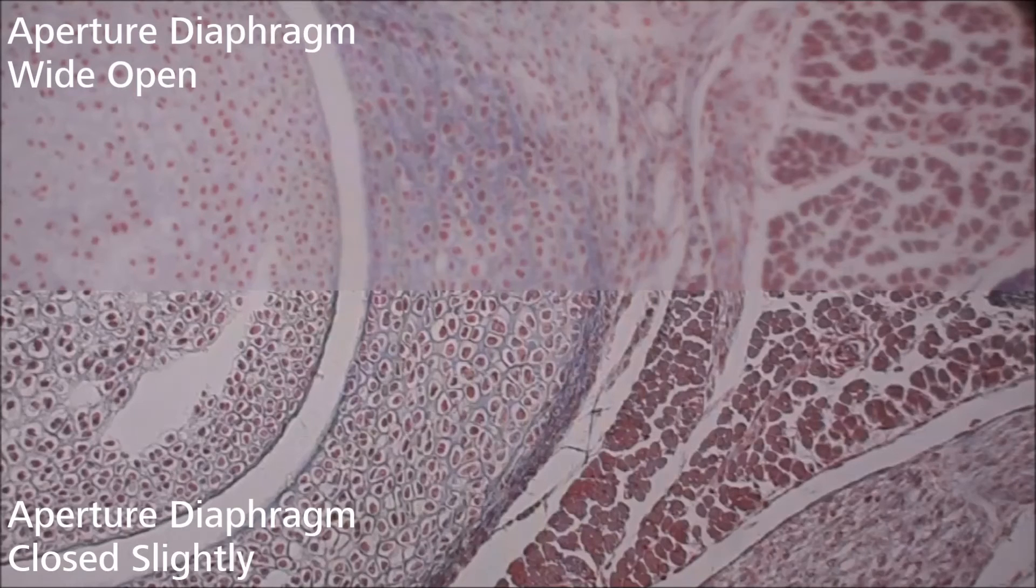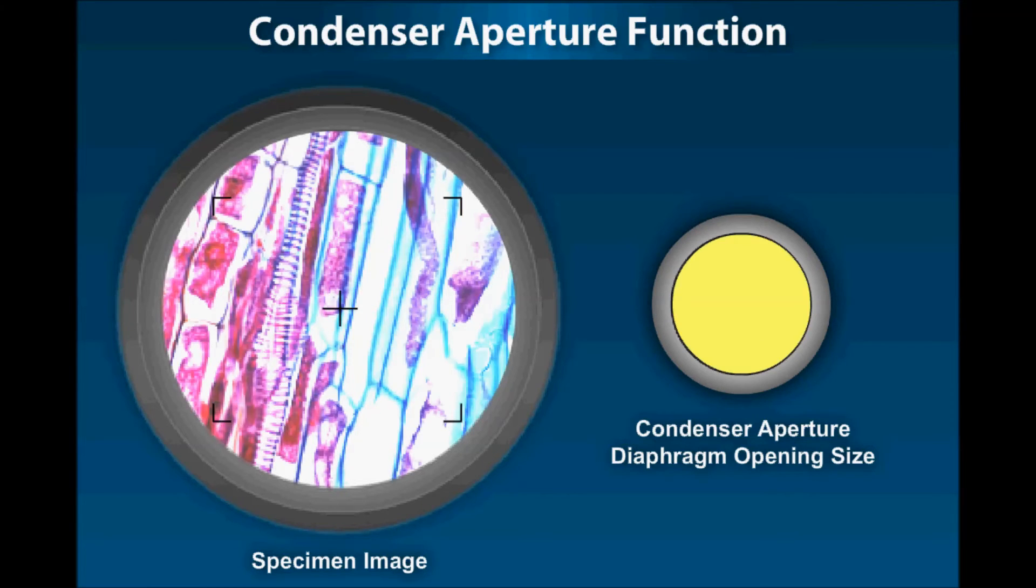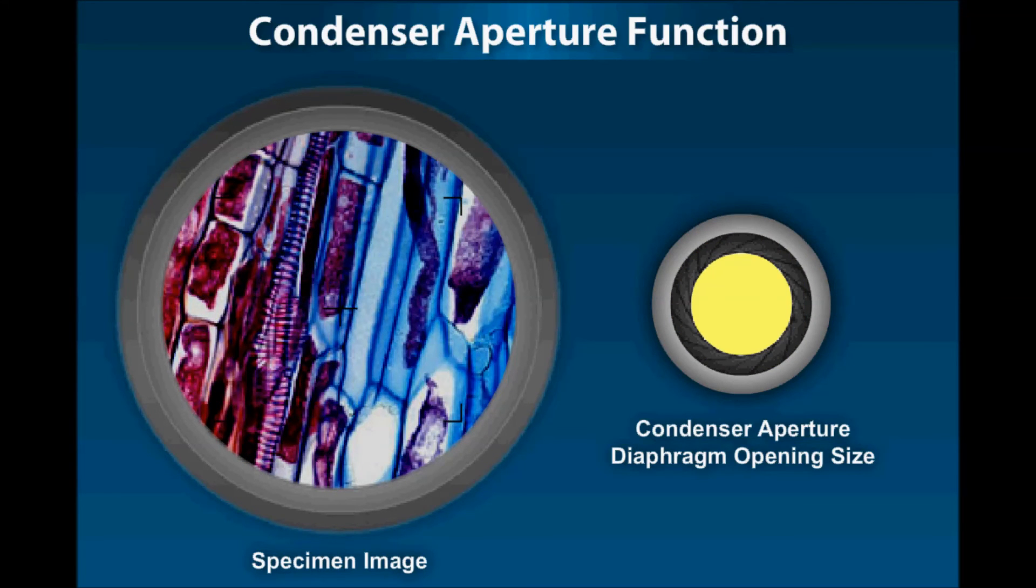Setting the aperture diaphragm opening too small will steal resolution from your image. Never use this diaphragm to control the brightness of your illumination. Use neutral density filters instead.